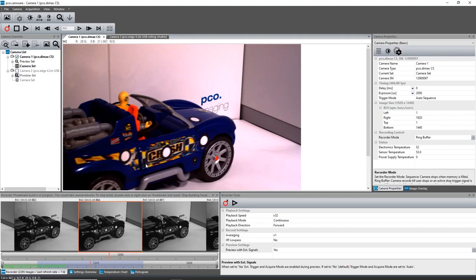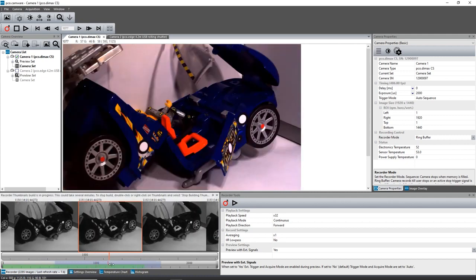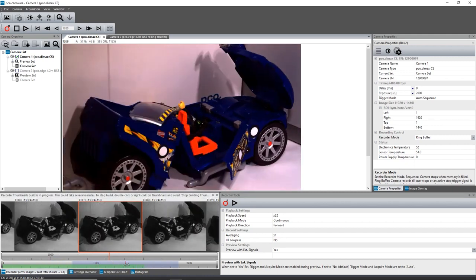You can scroll through the thumbnails by dragging the orange bar with the mouse or by the mouse wheel while the cursor is over the image number bar. The arrow keys on the keyboard allow you to scroll through the thumbnails too.